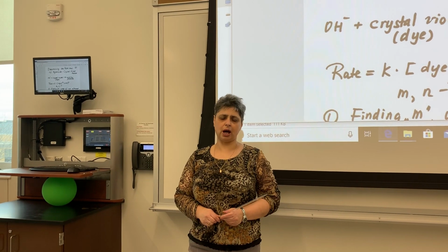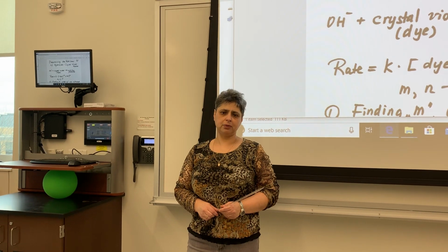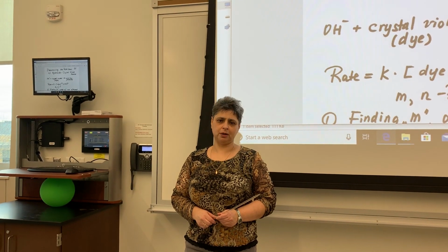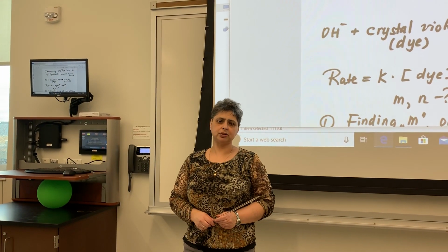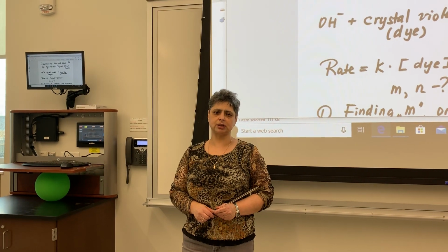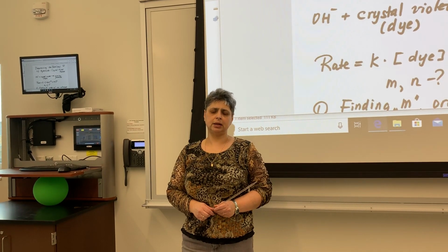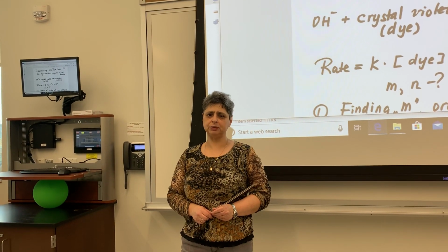I hope you all are safe and sound at home and are well and are able to switch to this unexpected, abrupt mode of teaching and learning remotely. Today we're going to cover the experiment that you would be doing this week, which is determining the rate law of the reaction between sodium hydroxide and crystal violet. And I'm going to go over the notes like I typically would.